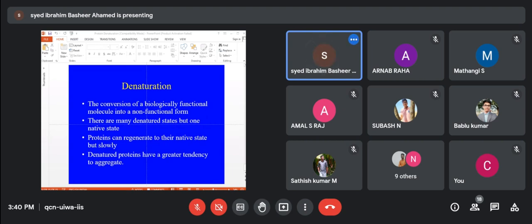You have your protein. I add 10 millimolar urea, and in another tube I add 100 millimolar urea, in another tube 200 millimolar urea, and in another tube 500 millimolar, and finally maybe 1 molar or 2 molar urea. Students, you are following, right? Yes, sir. So now I am adding urea at increasing concentration to each tube. The protein concentration is the same.